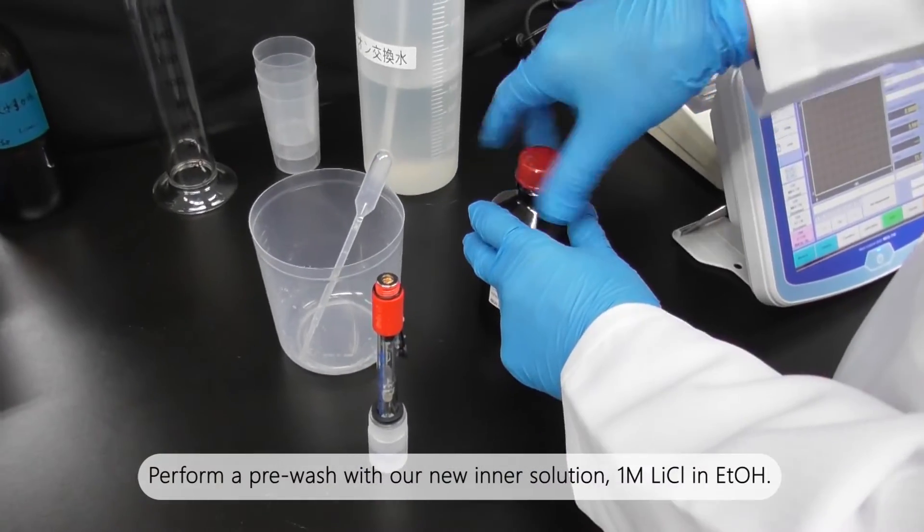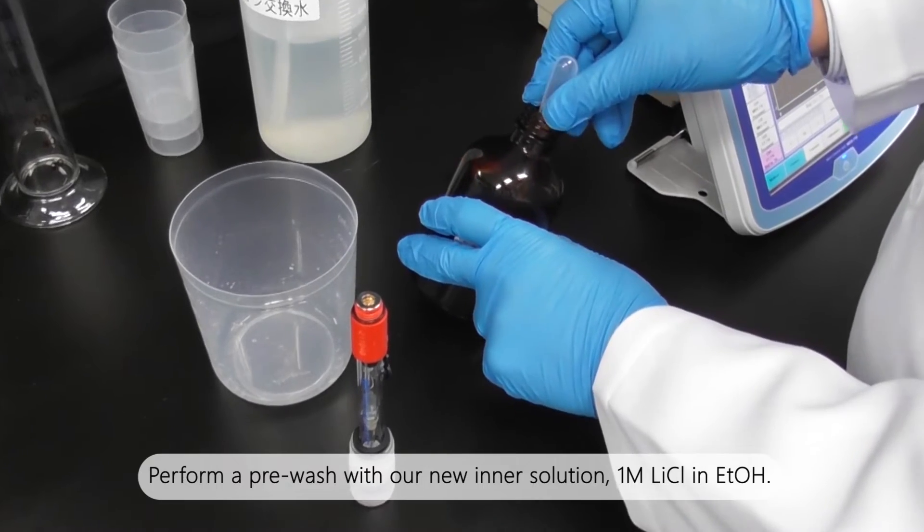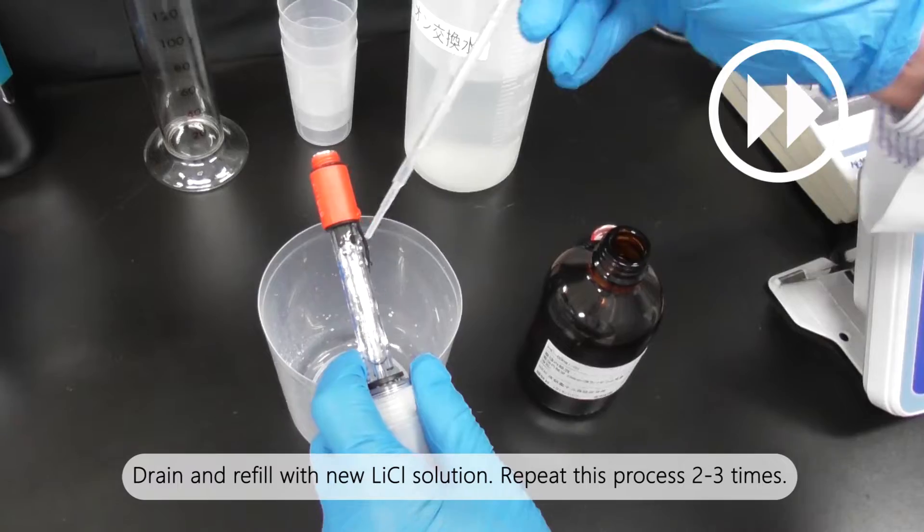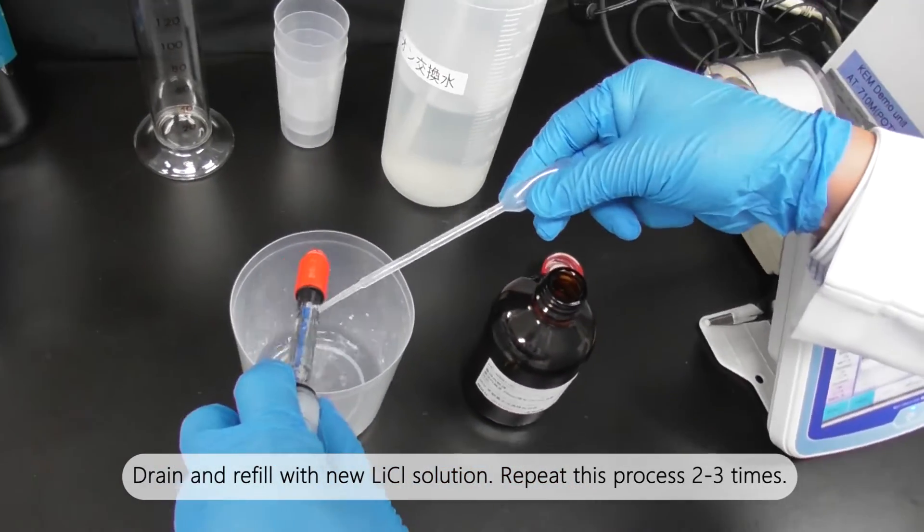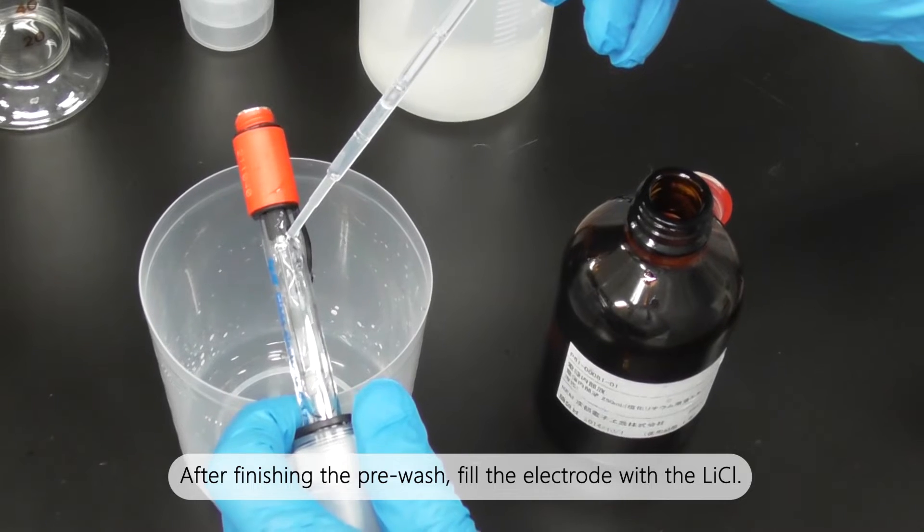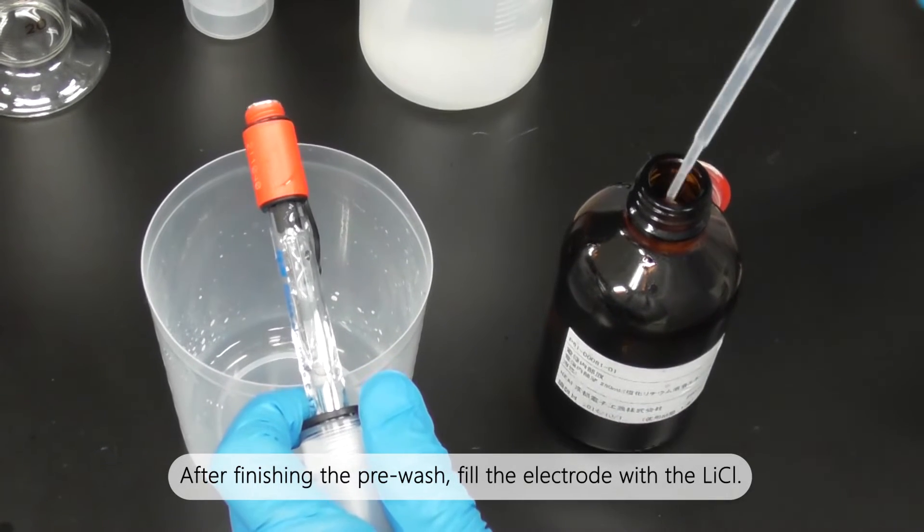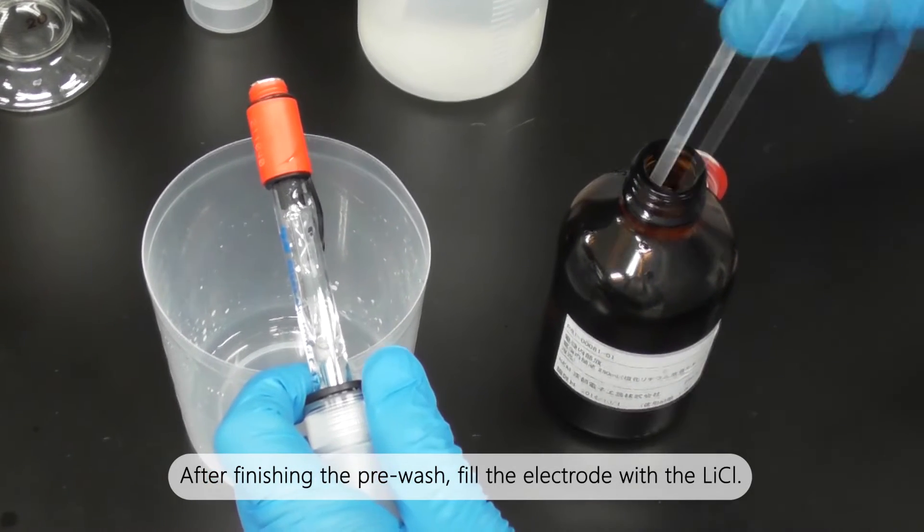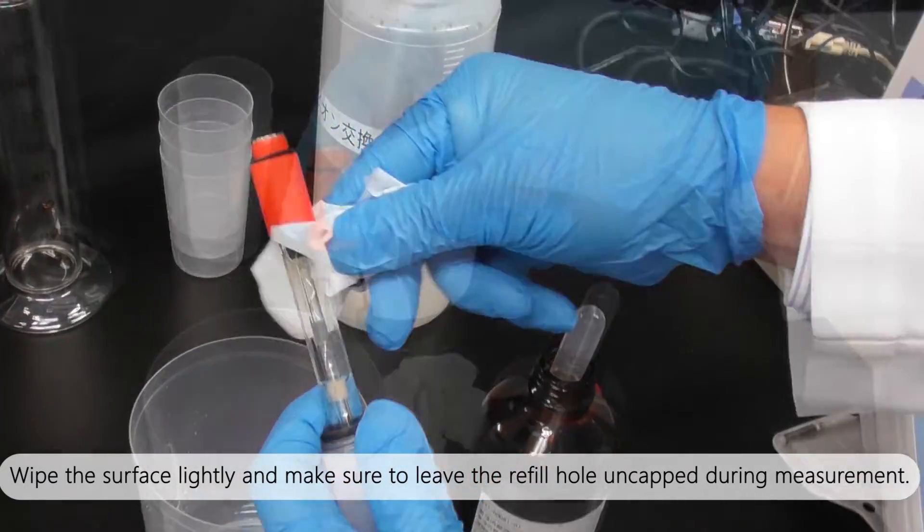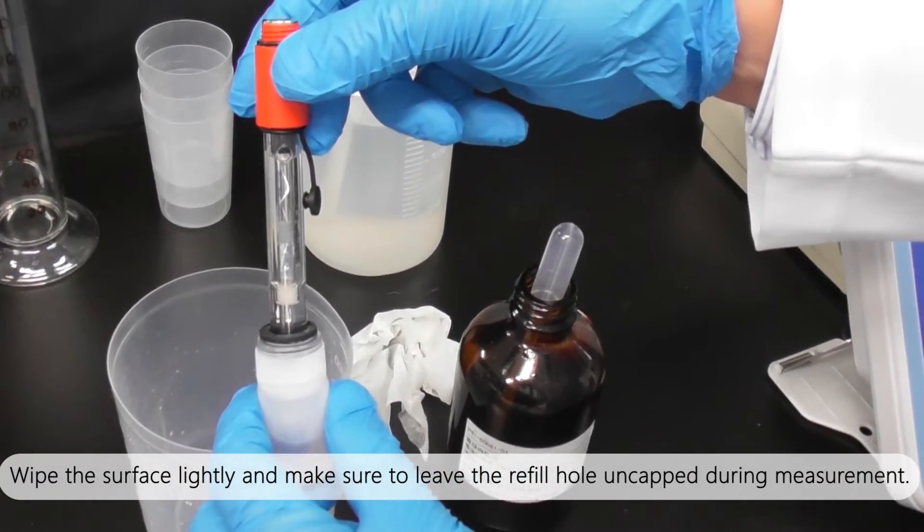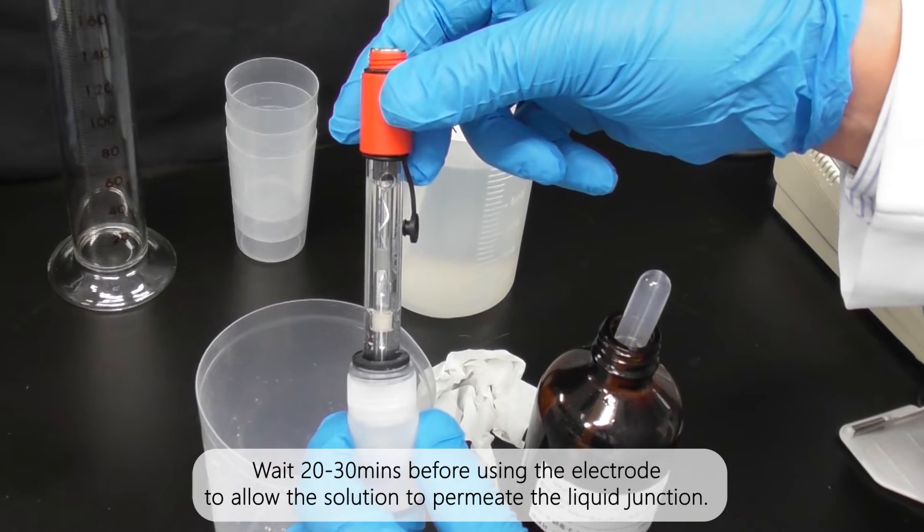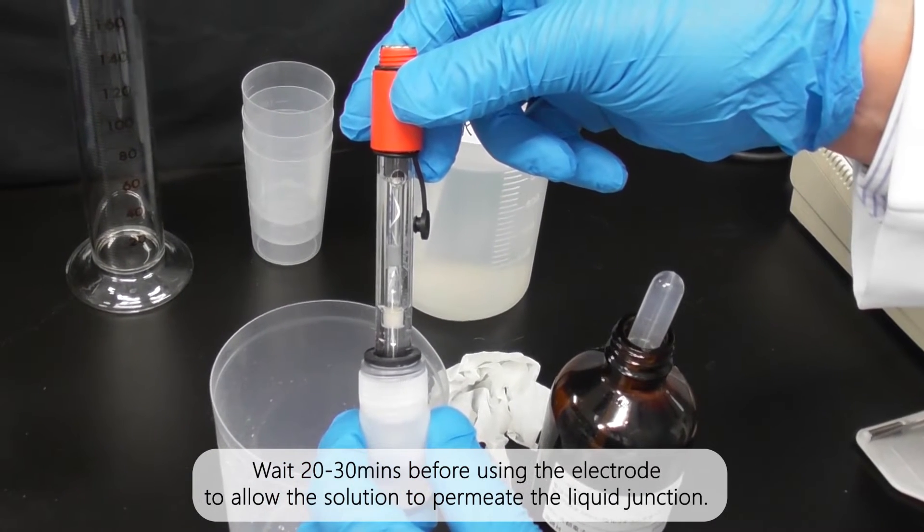Perform a pre-wash with our new inner solution, one molar lithium chloride in ethanol. Drain and refill with new lithium chloride solution. Repeat this process two to three times. After finishing the pre-wash, fill the electrode with lithium chloride. Wipe the surface lightly and make sure to leave the refill hole uncapped during measurement. Wait 20 to 30 minutes before using the electrode to allow the solution to permeate the liquid junction.